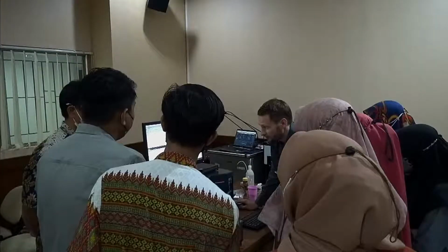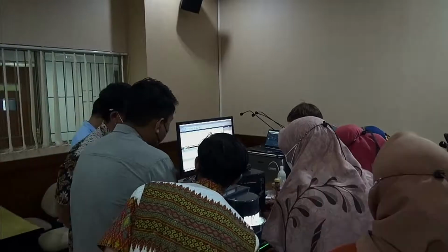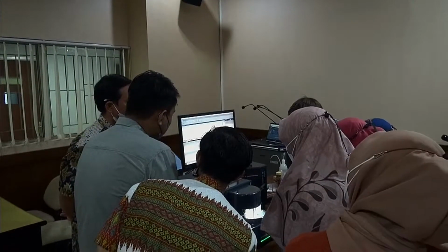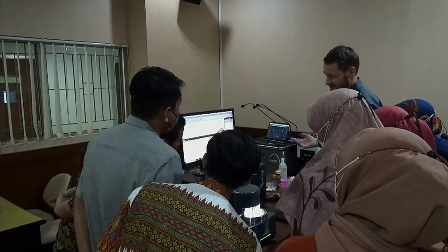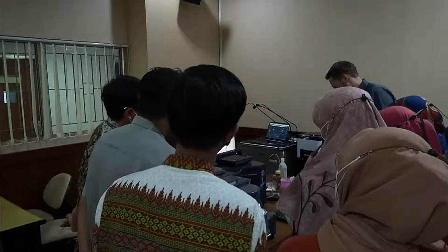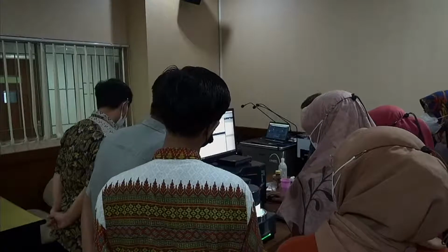Anyhow, this is also a very beautiful measurement we have here. Reproducibility is actually really, really good for a natural sample. A little bit strange, it's really in the direction of the F500. If you check that, you see. That's a coincidence, by the way. This was by no means planned. You see, I have 3 batches of carbon black. I just picked one, and I didn't know that this would come out in a very similar particle size range as the F500.